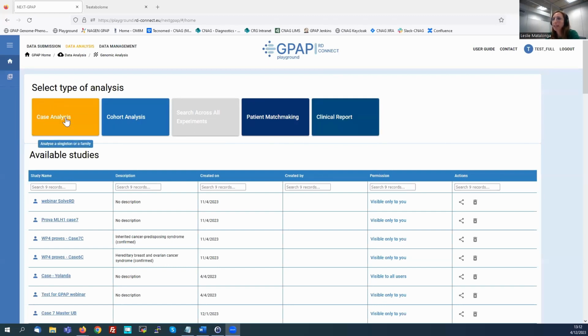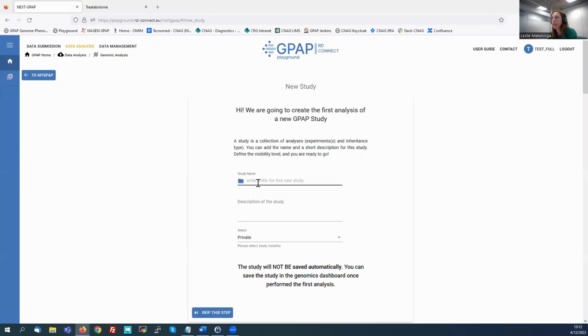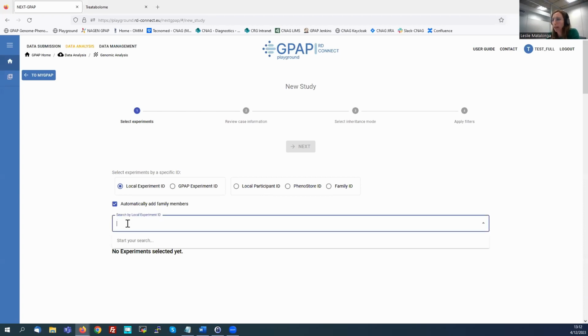So for the case analysis for a family, you will first click here on case analysis. And as I mentioned, now you will be able to save the information in the system. So you can enter the title of your study. I will say case demo webinar. And now you have different IDs that you can enter to identify the index case you would like to analyze. Today we will be analyzing the case 15C.